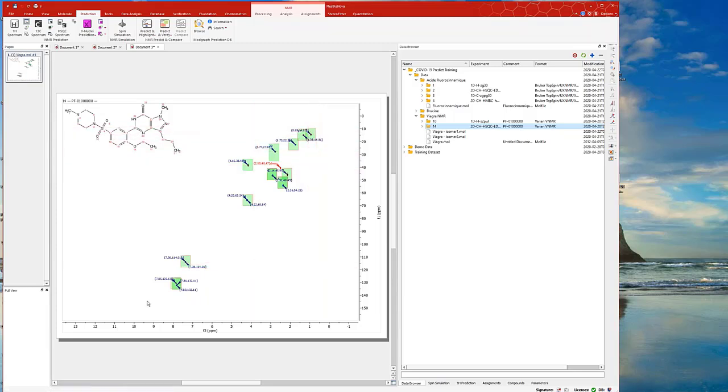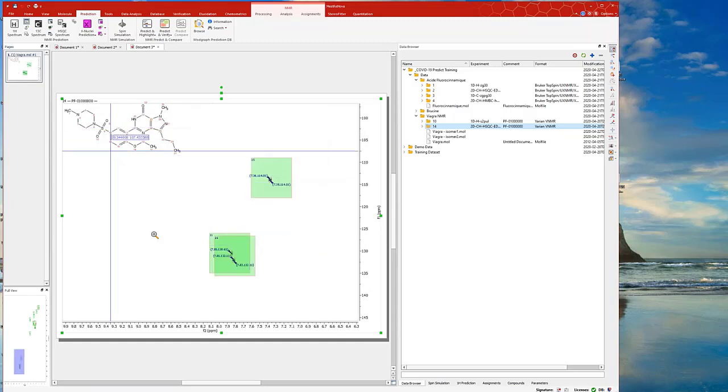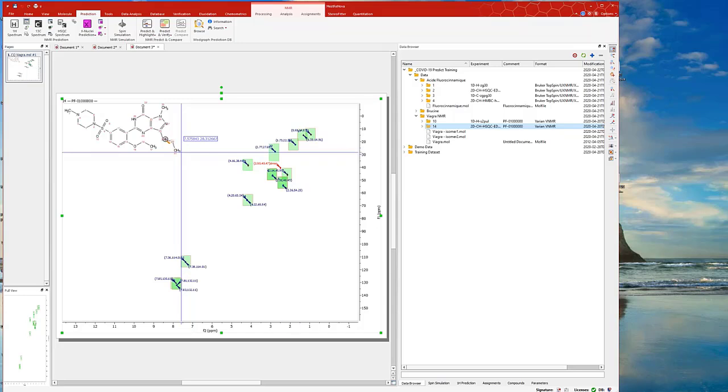Okay, so again, let's zoom into the aromatic region around here. For this CH11, you see the range and the highlight on the axis. That's this box, and there is an experimental peak inside it. That's why it's colored green. If you go to the other one here, that's the next one. And this one, 16, it's this one. And so are the other ones. You can verify that. You can see all of those boxes are green because there's an experimental peak picked within it.